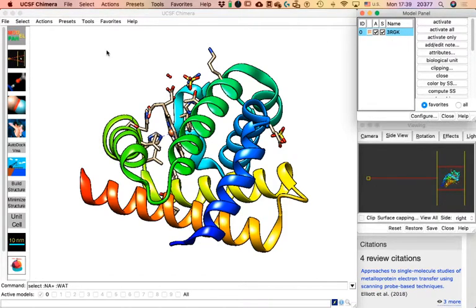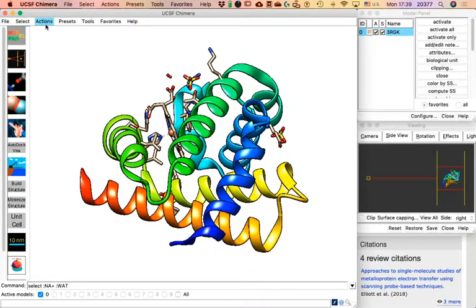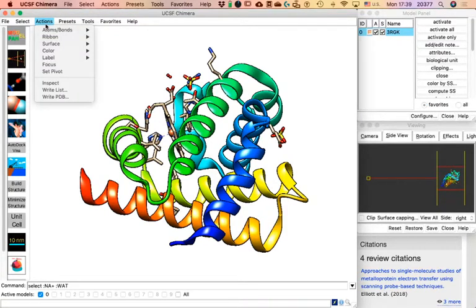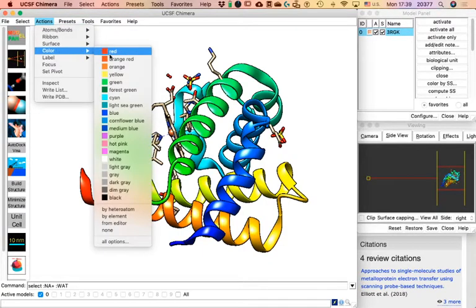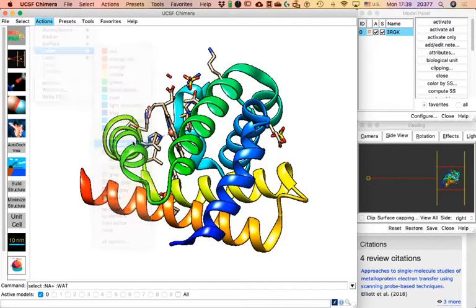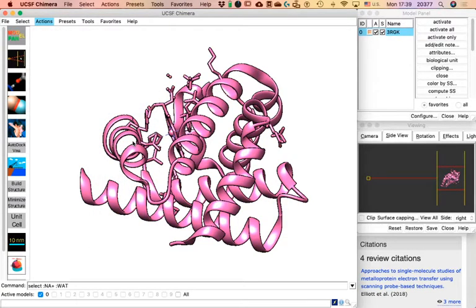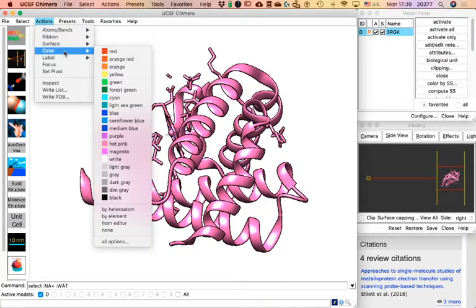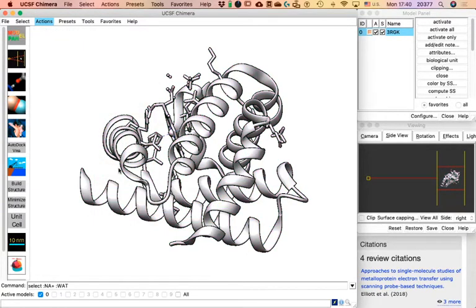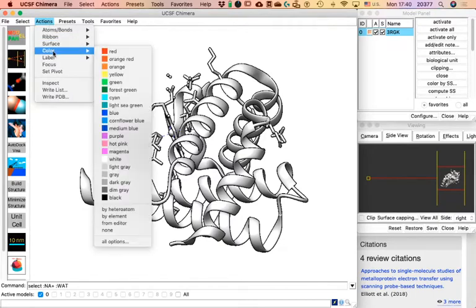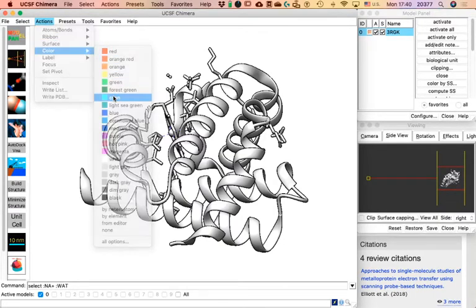Let me perform an action without selecting anything. Click on Actions > Colors and pick any color — everything on screen will change to that color. I'll pick hot pink — there. Now go to your Model Panel, click the 'All' radio button, then click 'Color by Secondary Structure' — since there's no selection, everything on screen will be affected.